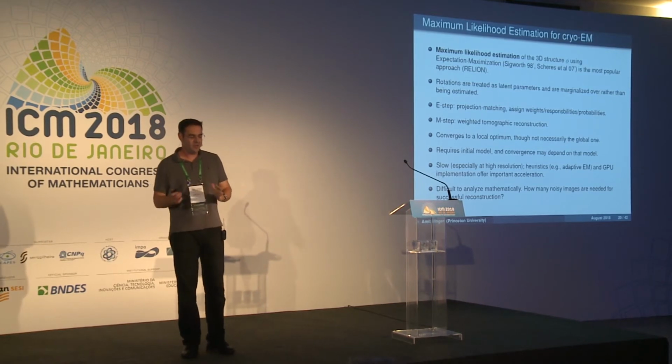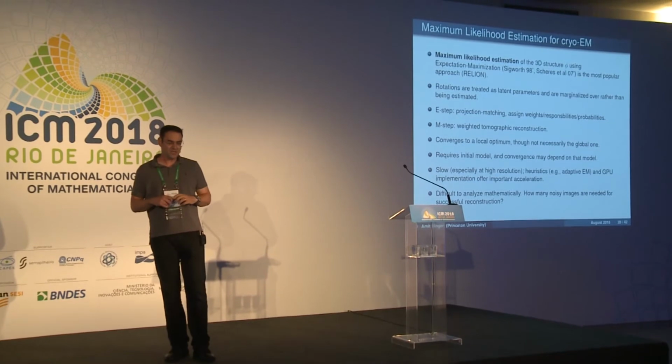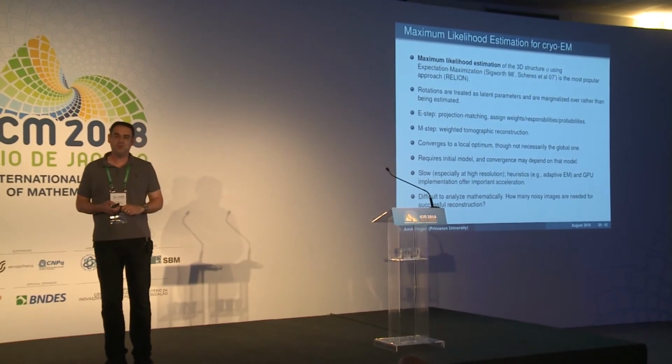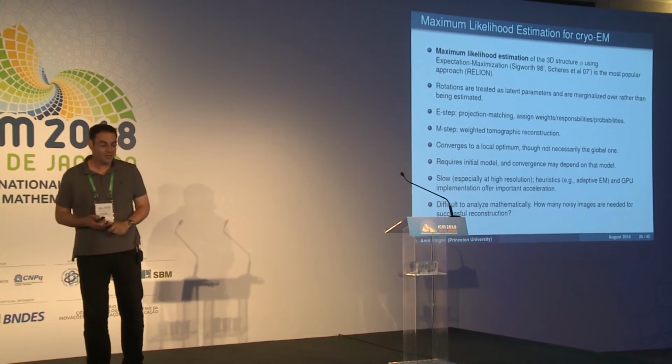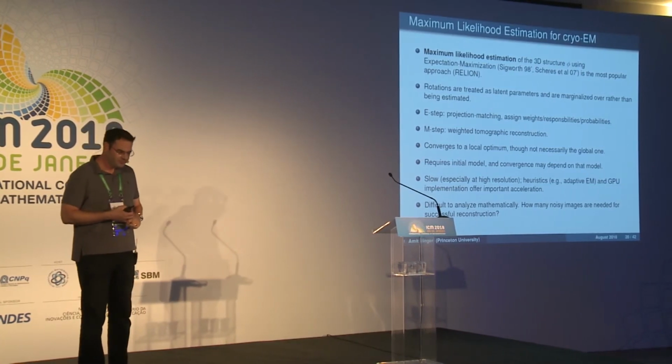And there is an E step and an M step. I don't really want to get into it very much. Just, in the E step, you do projection matching, just like what our Oracle did, but you assign weights. You don't try to do hard assignments. And in the M step, it's just a weighted tomographic reconstruction.